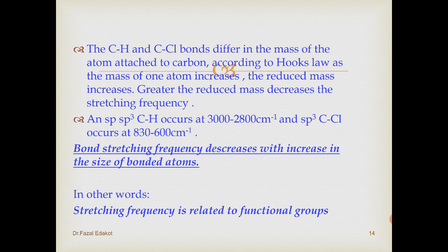As the reduced mass increases, the stretching frequency decreases. Please understand.